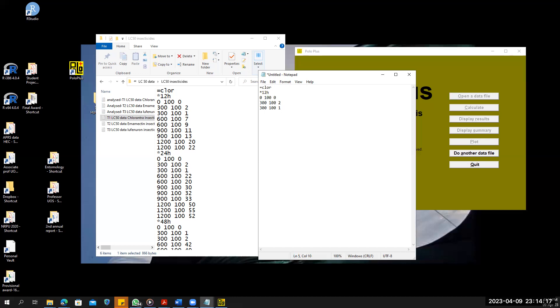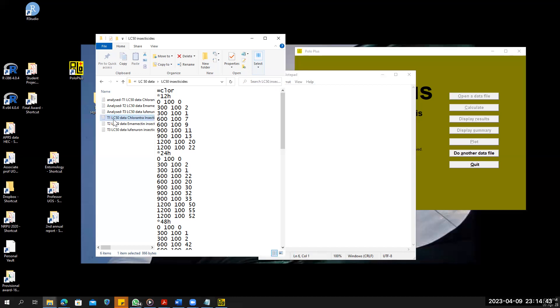I have already prepared a file which I will upload. The important thing is: enter the concentration, space, total number, space, and the number of individuals which are dead, then press enter so that the new line will be the same format. I have prepared this file — T1 LC50 data, Chlorantra insecticide — and I will use this file.